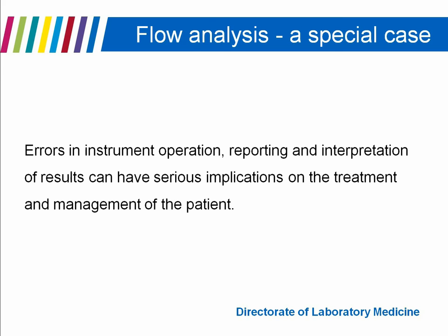It's very often said that flow cytometry is an art rather than a science. And whilst this is debatable, there's no doubt that flow cytometry requires a high degree of skill and understanding of how the instrument works, how the experiments are set up, and so on, more so than probably any other equipment that we would use in the lab.